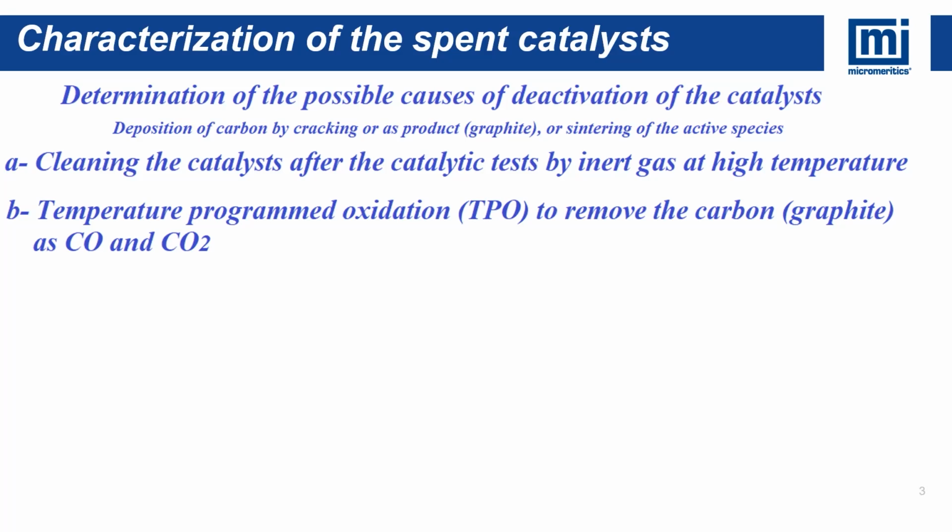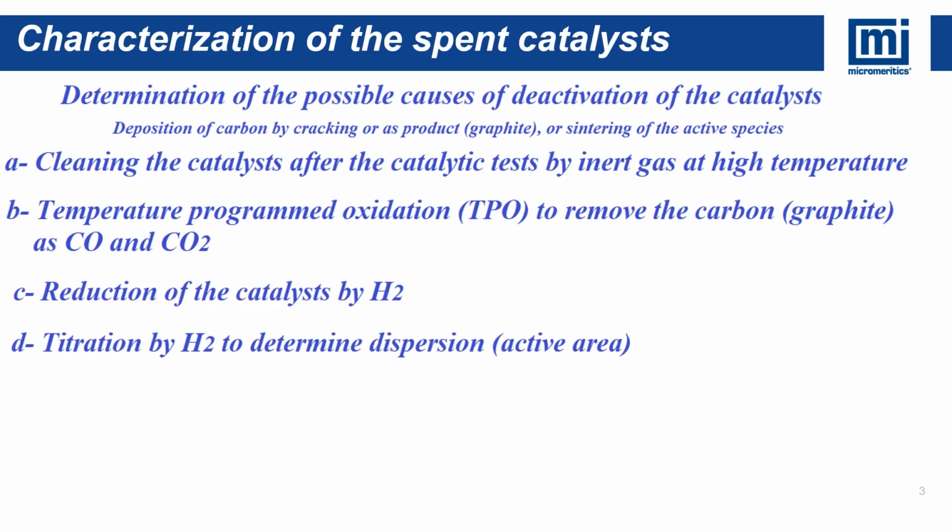In this case, of course, we use two techniques, as I'll show later. For simple reactions or simple processes, we use a TCD, thermal conductivity detector, and when we have more than one product, we have to use the mass spectrometer. As we will show you later, we have both techniques, the TCD and the mass spectrometer, to detect all the different products, as the TCD cannot identify the products coming from the reaction. So we have to use a mass spectrometer in that case.